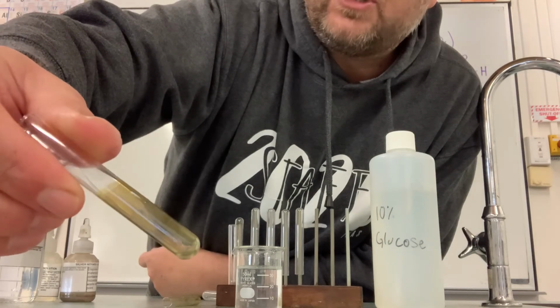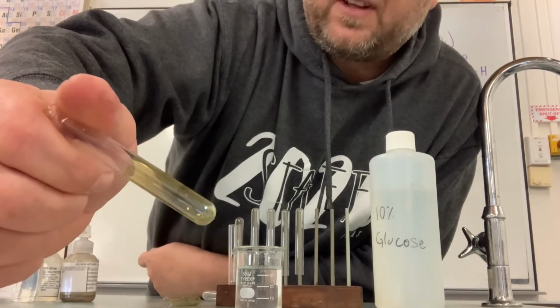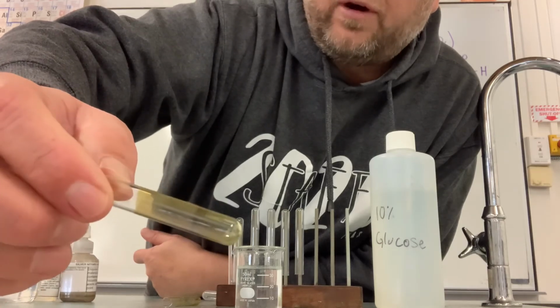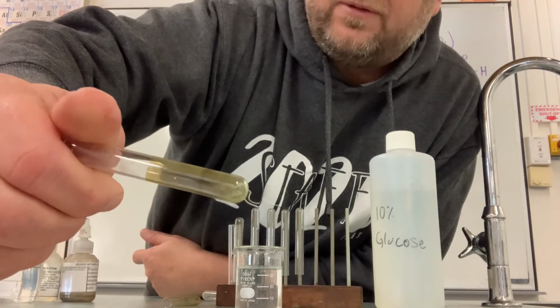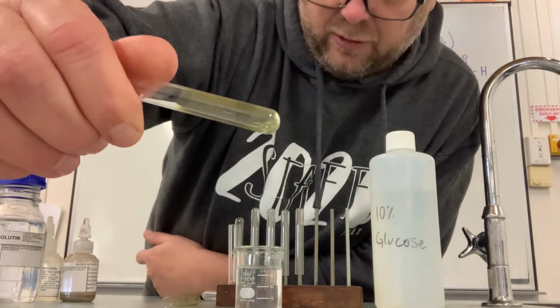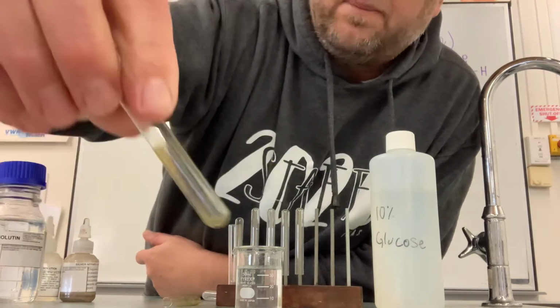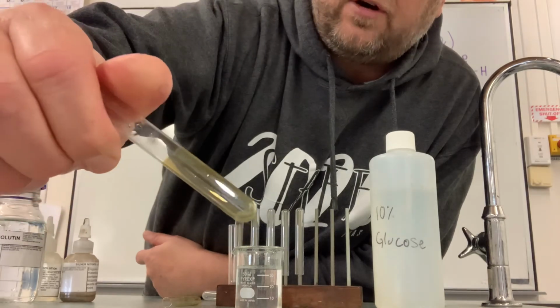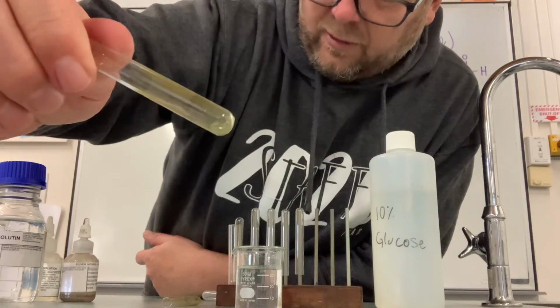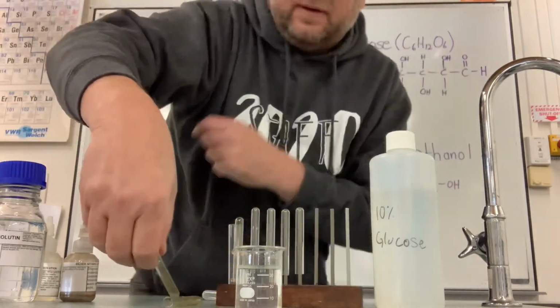If we look at one I did here before, you can see we get much more of that mirror finish. Now neither of those have worked perfectly to get a nice silver mirror, which looks really cool. I could muck around and try and better. Normally it's about just finding test tubes that have never been used before and that are completely clean, which I thought these were, but I'm not sure now. But you can definitely see the evidence of the change that is due to the presence of an aldehyde.